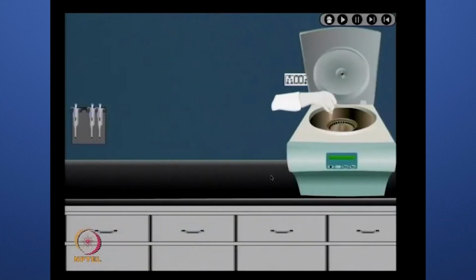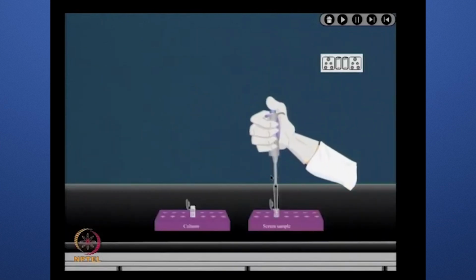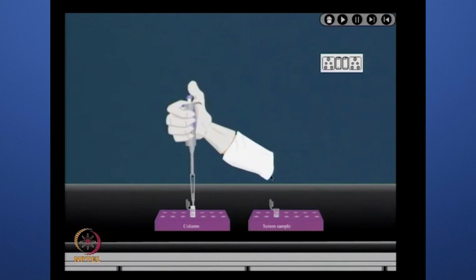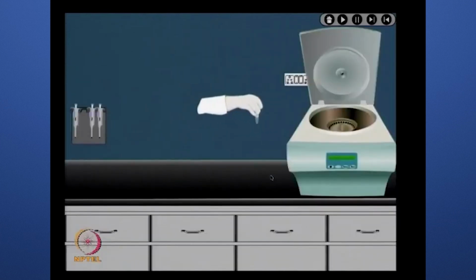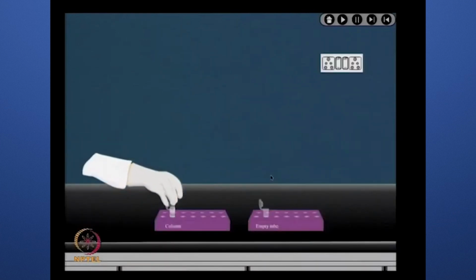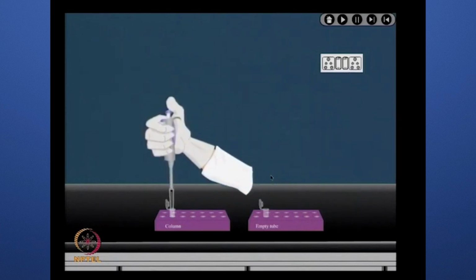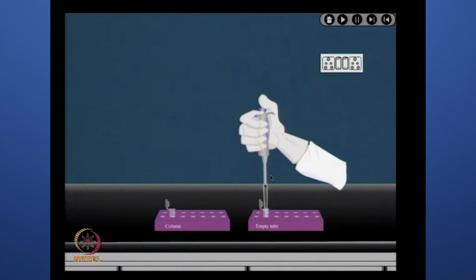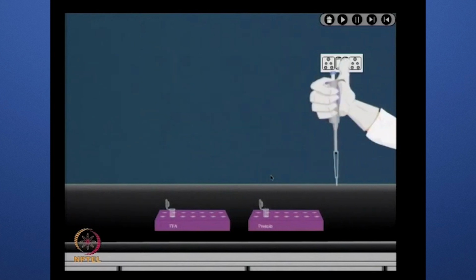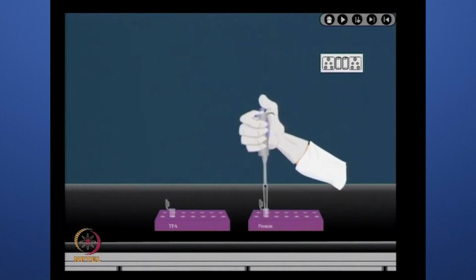Now, you can start depletion strategies to remove the abundant proteins. There are commercially available depletion columns. The affinity binders or ligands are immobilized to a solid support, the chromatographic medium, and used to specifically bind abundant proteins from a complex protein solution. The depletion strategy effectively enhances the resolution and provides the maximum number of spots on two-dimensional gels, thereby giving better coverage of the whole serum proteome.